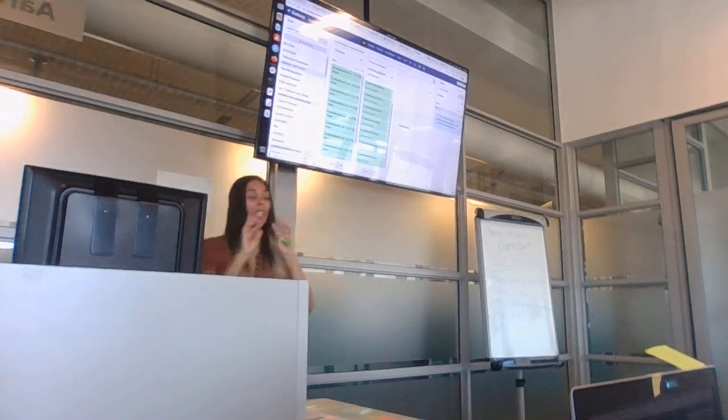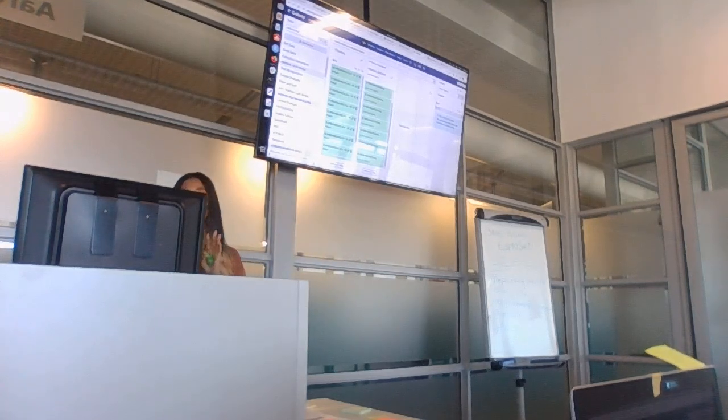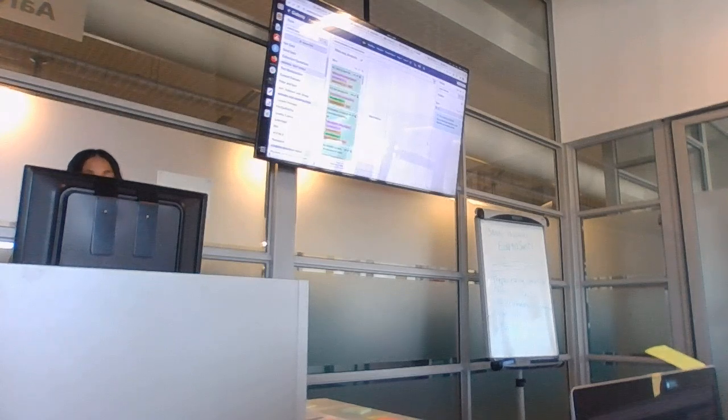But in our case, let's pretend that we want to copy that into a new directory. Our directory is called Kraken. We just created this. We're going to run this.